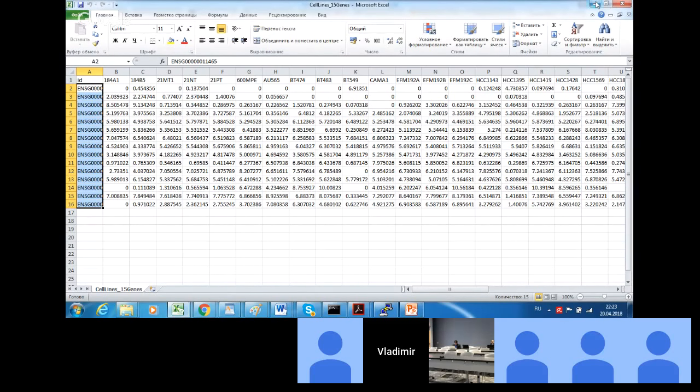In the case of the Tauber.bio.info platform, and in the case of many other platforms, the primary type of identifier used is Ensembl IDs, so it's relatively hard to understand the function of a gene, to understand what's going on with a gene using just an Ensembl ID. There are only a few people who remember Ensembl IDs for many genes. Gene symbols or gene ontology terms are much more informative, but in many tables we do not have this information.